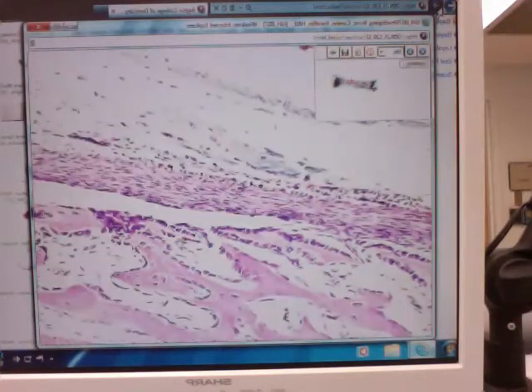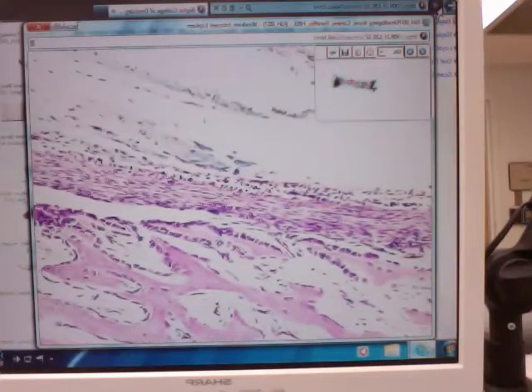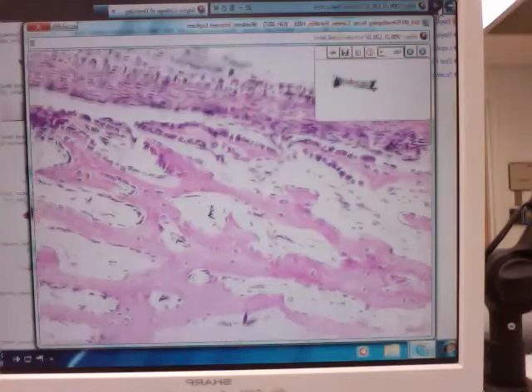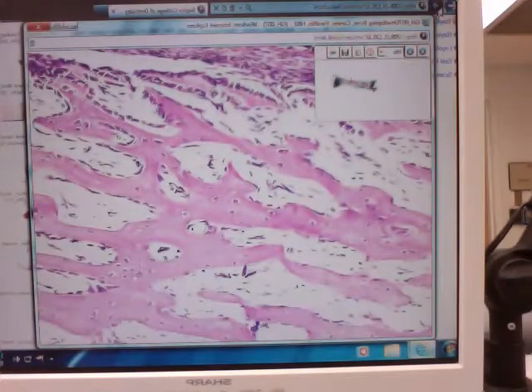All right. You know out here is going to be the periosteum, and it's made up of two layers. So you have an outer layer that's going to be thin, flattened cells that will make up your outer fibrogenic layer, and then typically a thinner layer with rounded cells as part of it that will be your inner osteogenic layer. Okay, so all that is your periosteum. Pardon me. That won't be the last time I say something wrong.